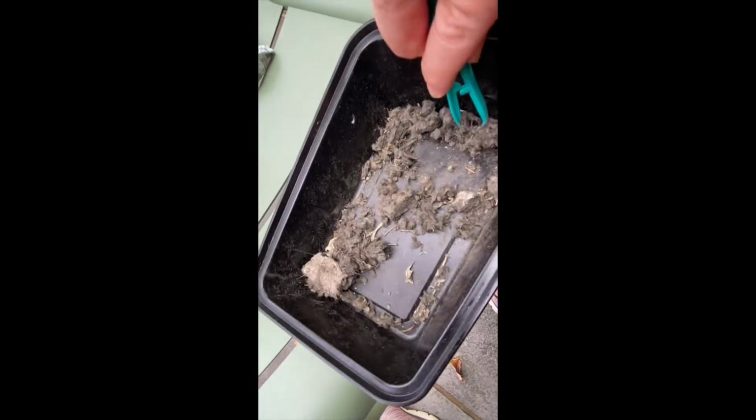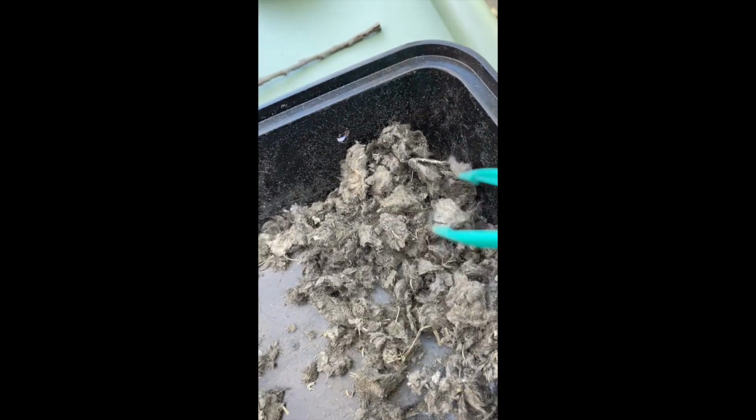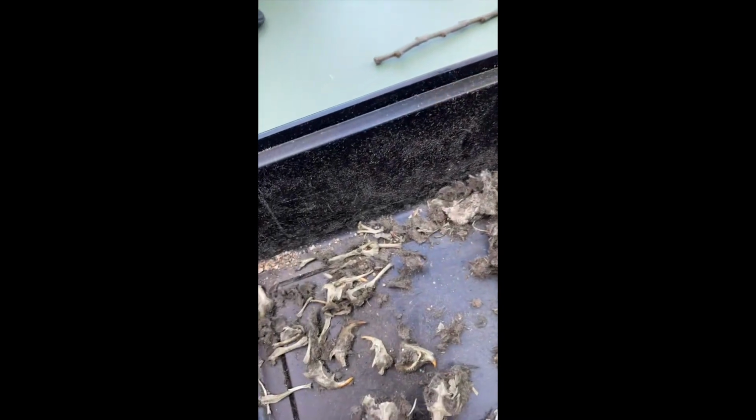See if we could sort out some pieces, and then we'll come back. Further dissection of this owl pellet, this great horned owl pellet. You can see we're left with a lot of fur, so this is all the undigestible stuff. But here are the bones that we uncovered, and it seems like we've uncovered quite a few jawbones. They look like small rodents. Obviously some other bones, like leg bones, I'm sure.